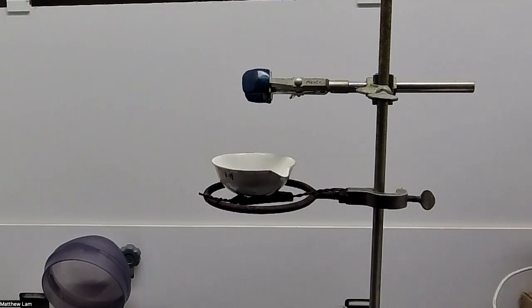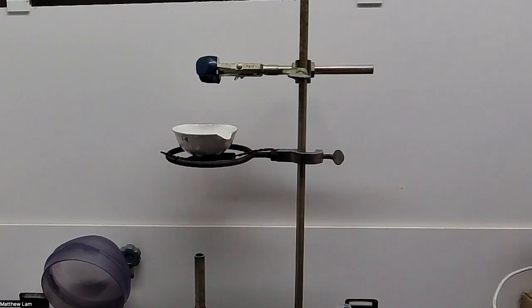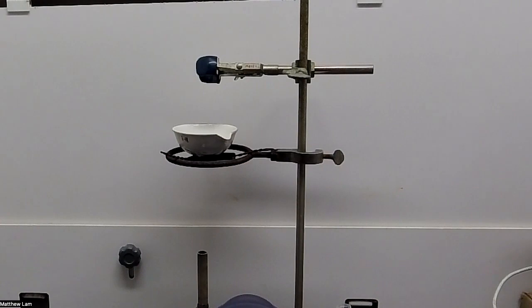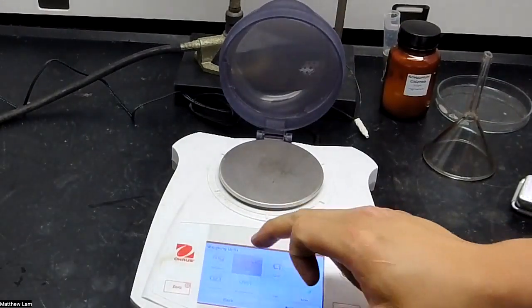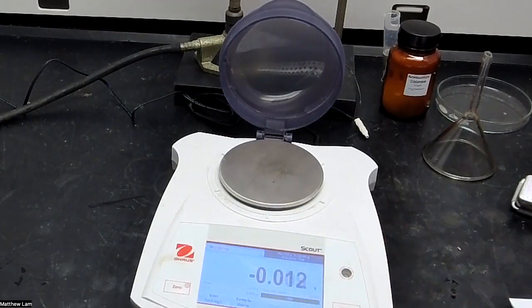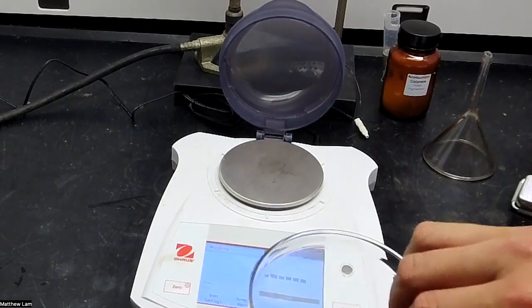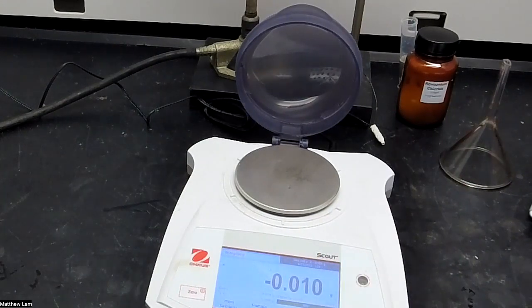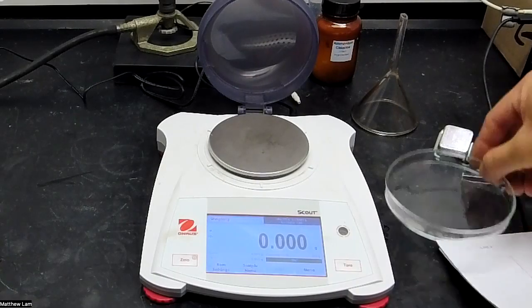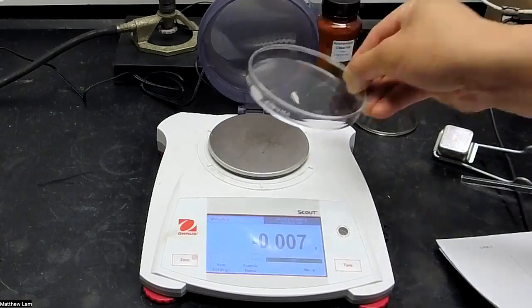So the first thing they want us to do is measure the mass of half the Petri dish. So I'll push this to the back, bring our balance to the front, make it so you guys can see it. They want us to measure half of our Petri dish. Let me reset that real quick.